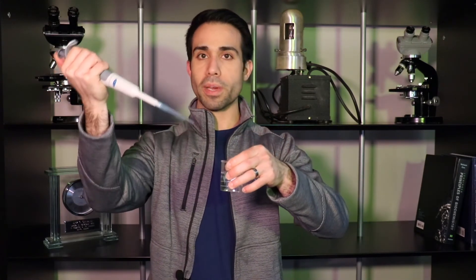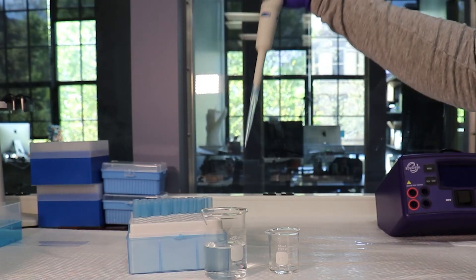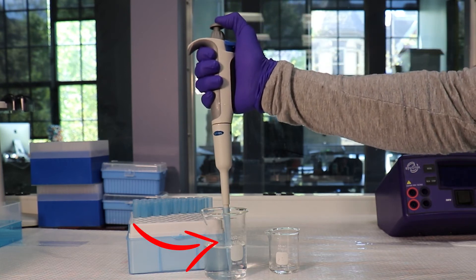When you're using one, simply take the liquid you wish to transfer and take your pipette. Push down on the pipette until you hit the first stop. Take the tip and dip it into the liquid and release. You'll notice the liquid is immediately drawn.